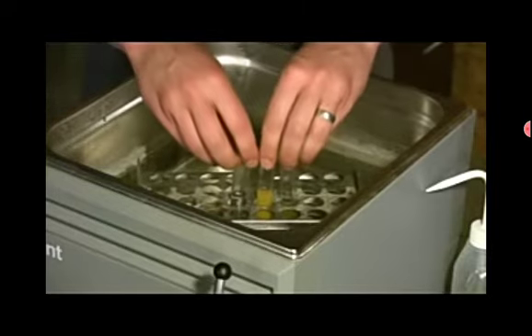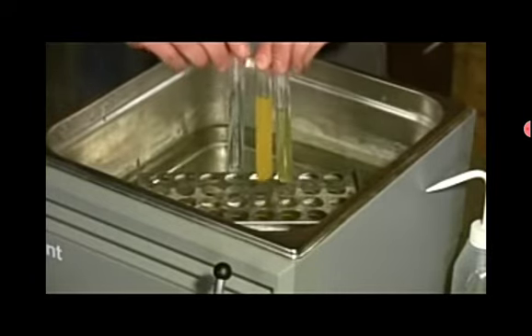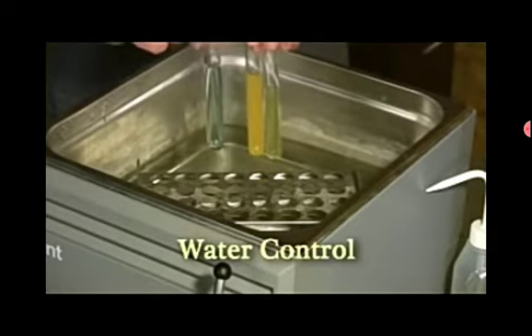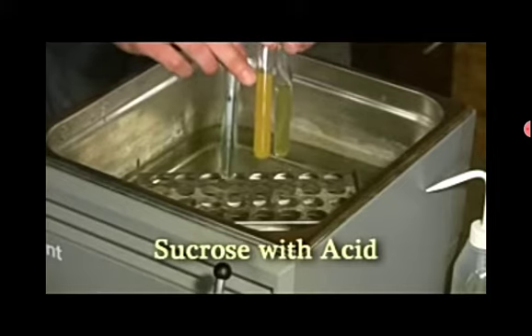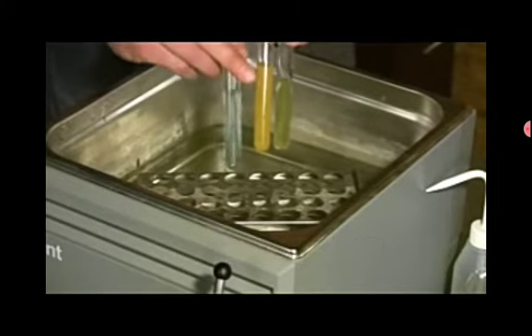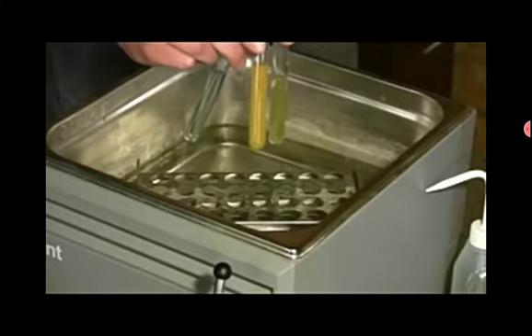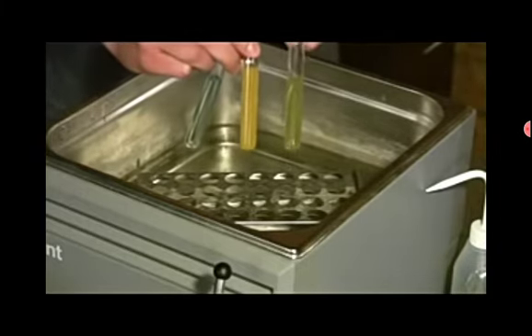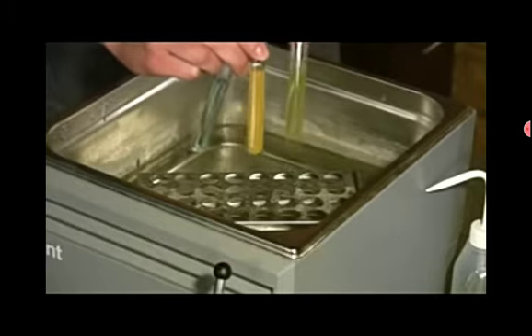It is to provide the condition of test with non-reducing sugar. As you can see, this is a control with water, so no reaction. Here, this is the test tube with sugar and hydrochloric acid. So at the end, you get a reaction because you broke down the disaccharide into glucose and fructose. And that one is basically sugar, so sucrose, with no hydrochloric acid.